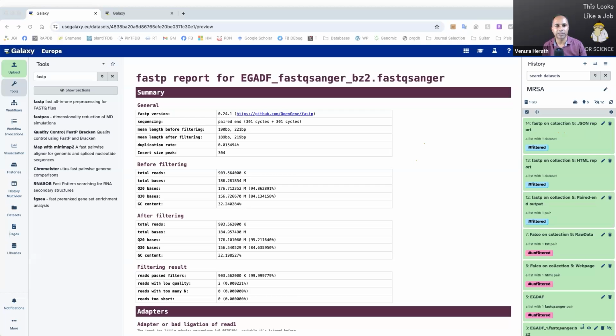Okay, so what we do is we need some tools to do that. Therefore, we have to have some kind of a reference database, and based on that, we can classify our samples. To do that, we use one of the most popular tools, called Kraken. I am pretty sure if you watch movies, you heard about the Kraken, that thing that comes to destroy the world. So you can check it afterwards after the class.